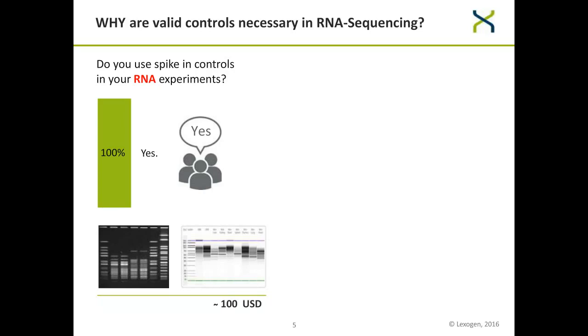Now, this is the point where this webinar becomes interactive. So the first time we do this, I will push out the poll, and that should be working right now. So I want to ask you, the audience, have you used RNA spike-ins in NGS experiments before? You can answer yes or no, and I urge you to do it pretty fast, because I think in 5 seconds this poll is already closing.